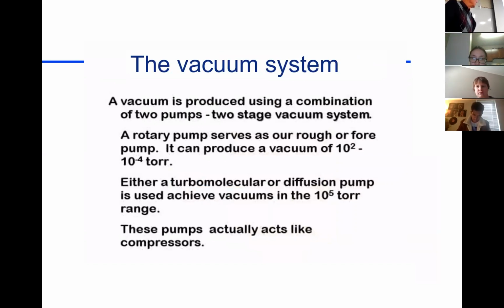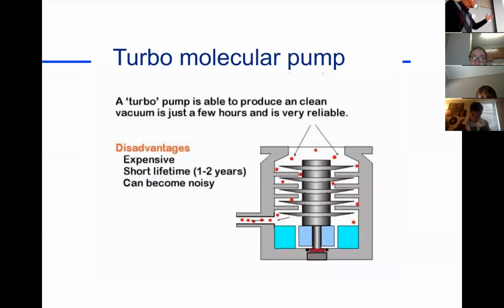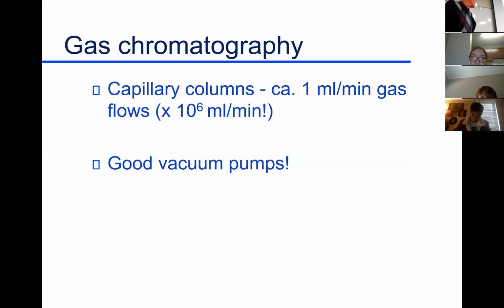And so we have what we call a turbo pump, a turbo molecular pump. And that can get us down into the region we like. We like to see about 10 to the minus 4 torr inside of that mass spectrometer so we can get good data. If we don't have good vacuum in the MS system, basically, all the ions we just formed, the bits and pieces, will react with air and they'll be neutralized and gone. So we absolutely have to have a good vacuum, and that is accomplished in this manner. Turbo pumps is what they're called.